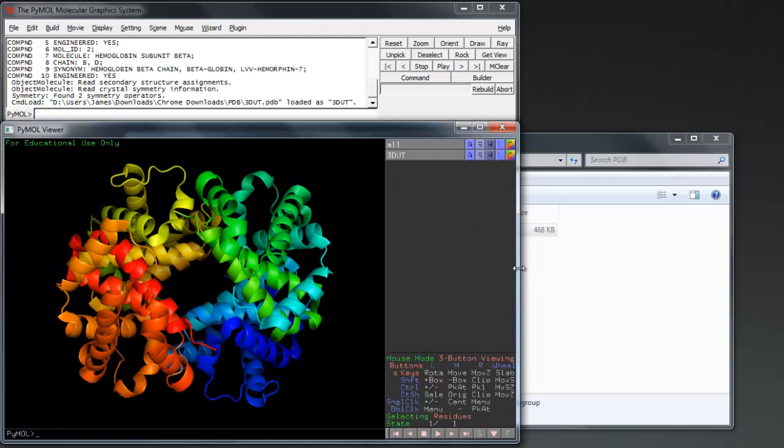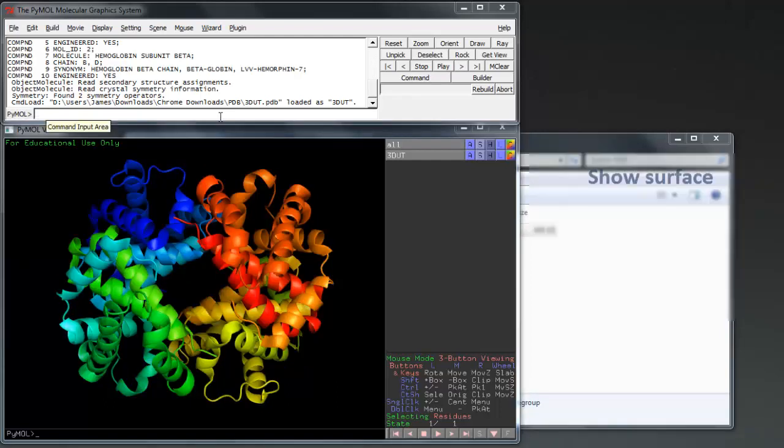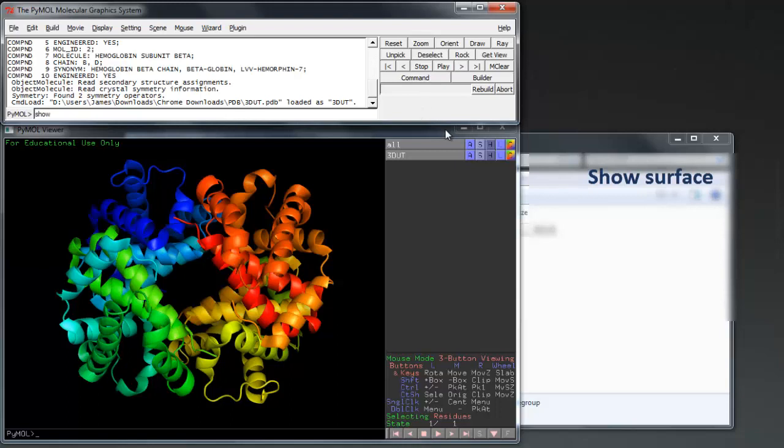You probably have a handle of the UI now, so let's try the command prompt. It uses the Python language for command entry, a fairly intuitive method which after a bit of practice becomes very simple. Try the command show surface to show the surface of your protein.